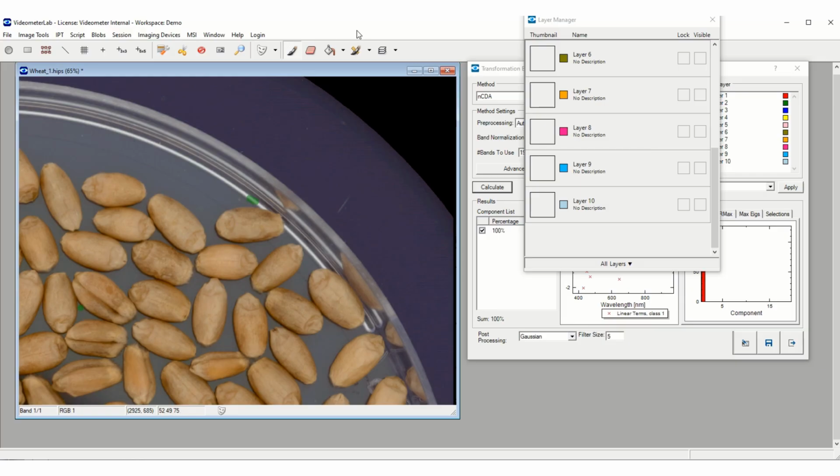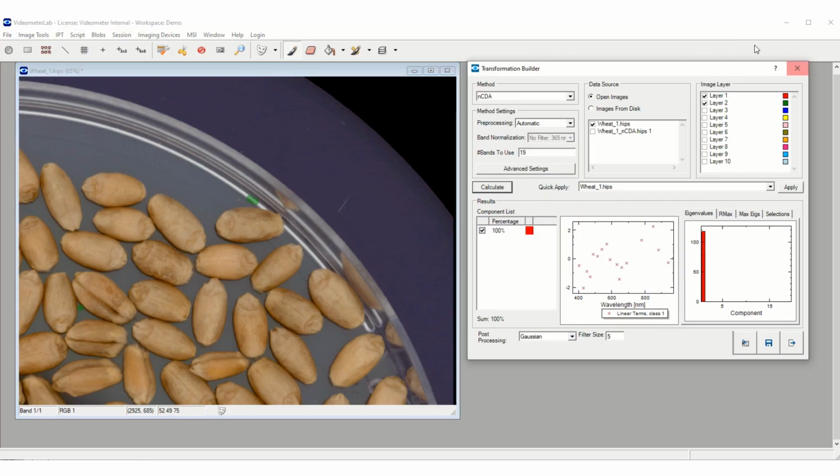So let's take this painting and press calculate here, and I get an eigenvalue which is more than 100. So I have separated what I painted red from what I painted green with more than 100 standard deviations, which seems to be quite a good result. I could go in and apply that on my image.